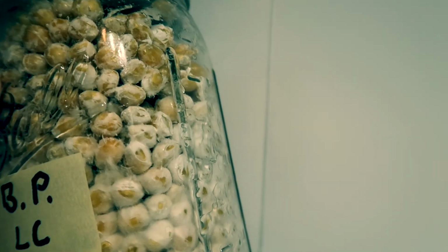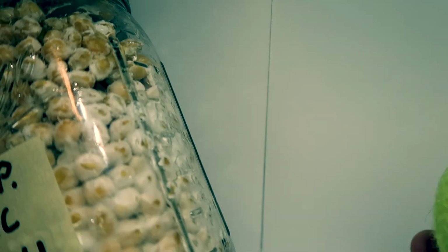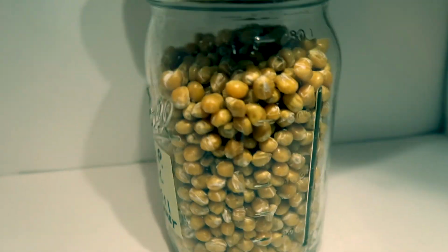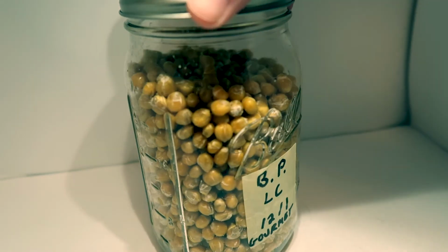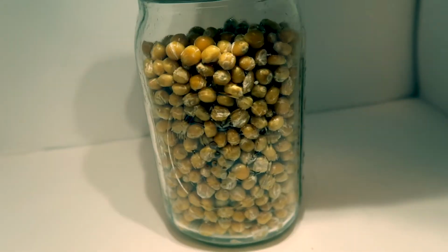And how I go about breaking up these grains to break and shake is simply take my dog's favorite toy right here, bang the jar against it. Of course, you can use something like a bike tire or a car tire, the old traditional methods that have been passed around for 30 plus years. You do not want to bang the jar against a hard surface to break up these grains because you can end up shattering it. So always use a soft surface to try to break up those grains.